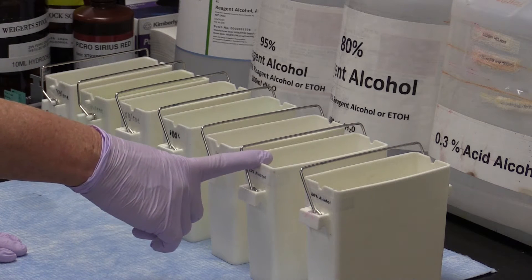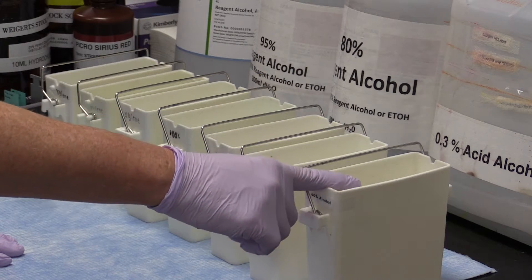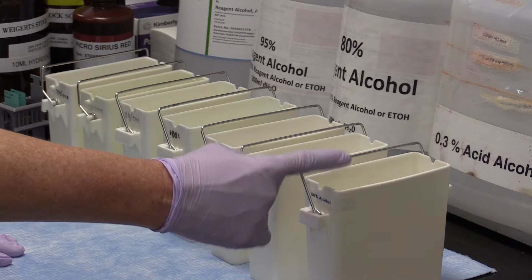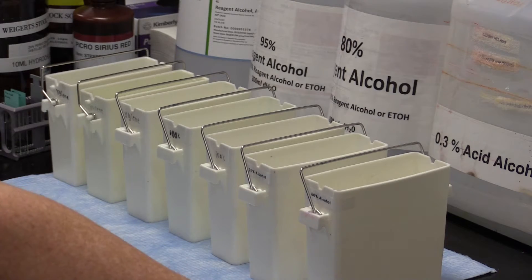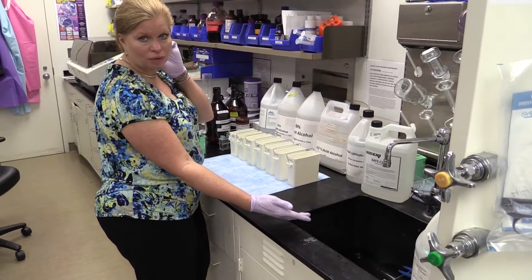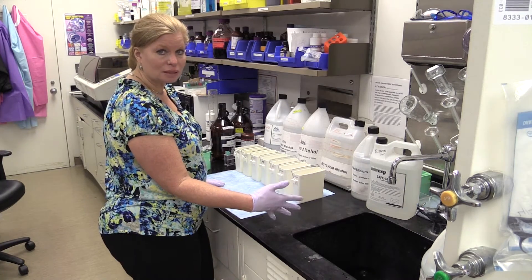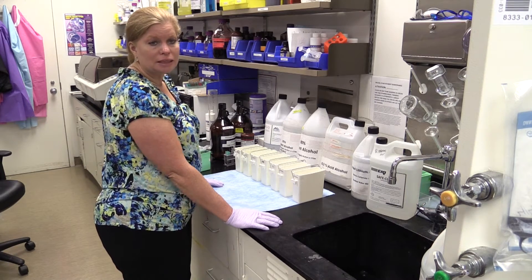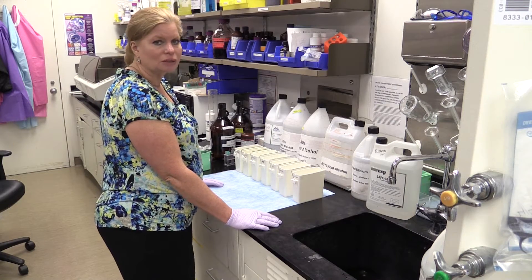Next we have 95% alcohol because we're starting our hydration process — it has some water in it — and we go to 80% alcohol, which is further hydrating. You can also use 70% alcohol, that's not a problem. Then we go into actual tap water, running tap water, for a minute or two. Some labs may use DI water for this final hydration depending on how controlled they want the stain, but for most things regular tap water is just fine.